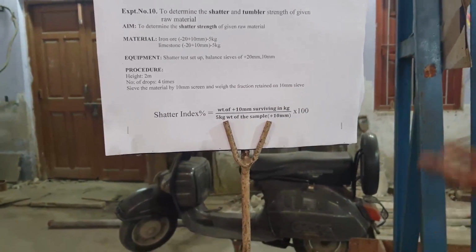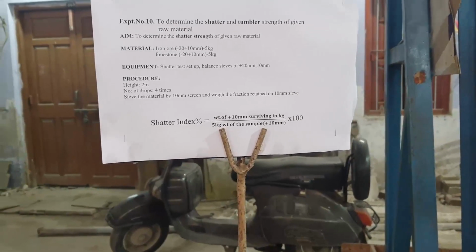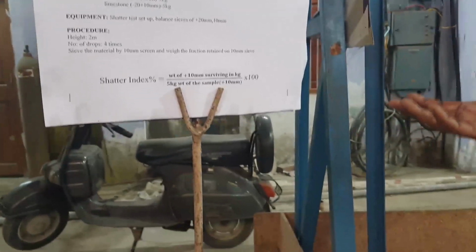After that, we will do the screening. Once you screen, we take a 10 mm sieve. For that, the 10 mm sieve is there.